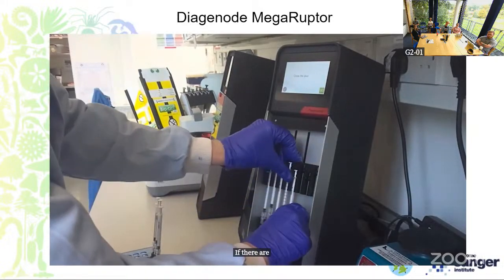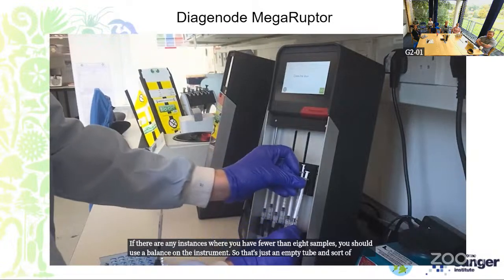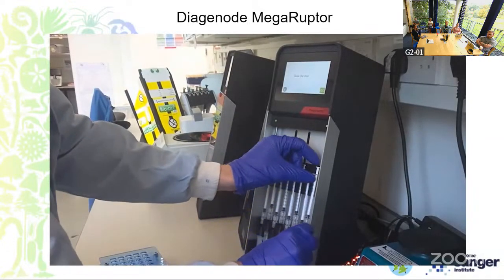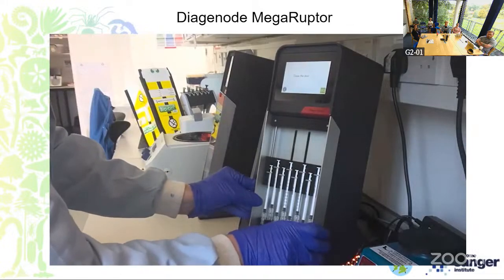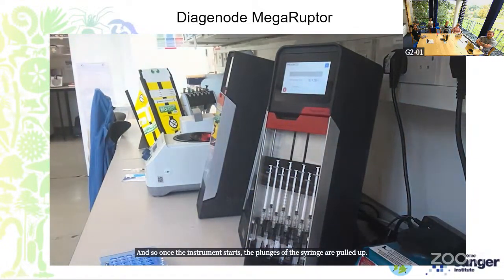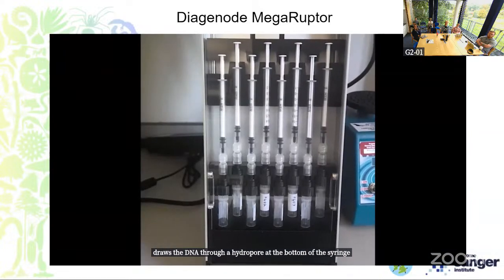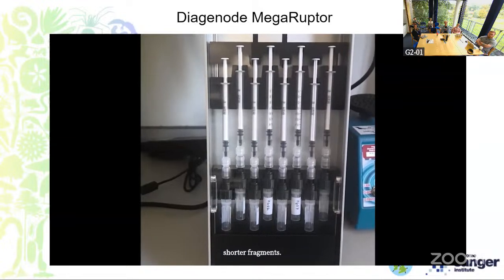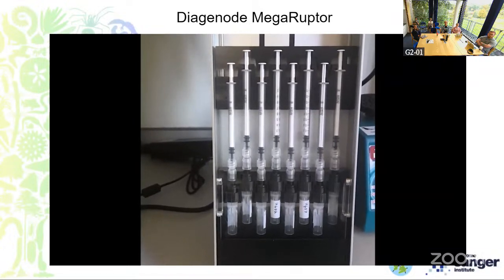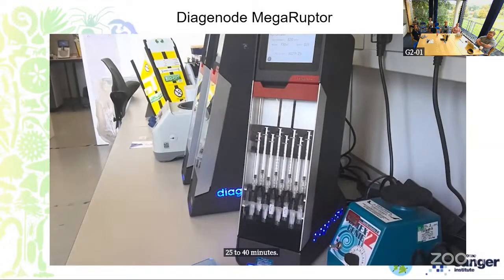If you have fewer than 8 samples, you should use a balance on the instrument, which is just an empty tube and an old syringe. Once the instrument starts, the plungers of the syringe are pulled up and pushed down, drawing the DNA through a hydropore at the bottom of the syringe, shearing the DNA into shorter fragments. A run in the Megaruptor takes roughly 25 to 40 minutes, depending on your volume and your concentration.